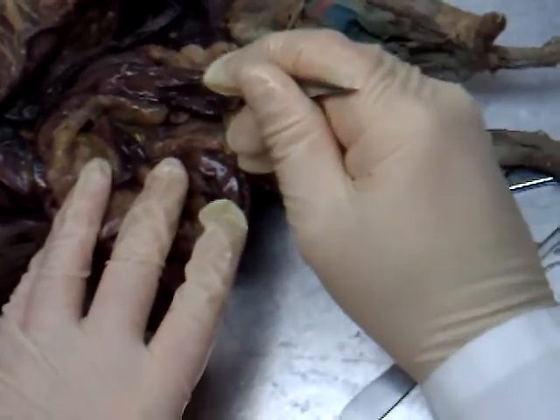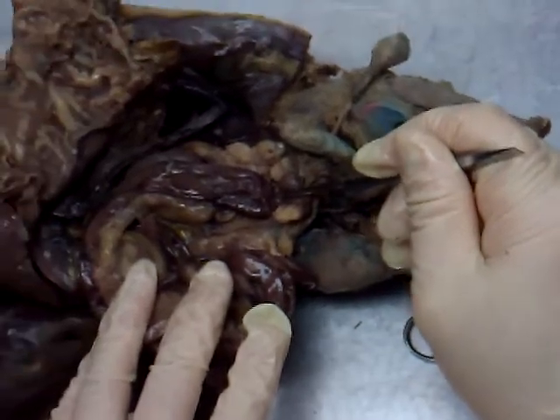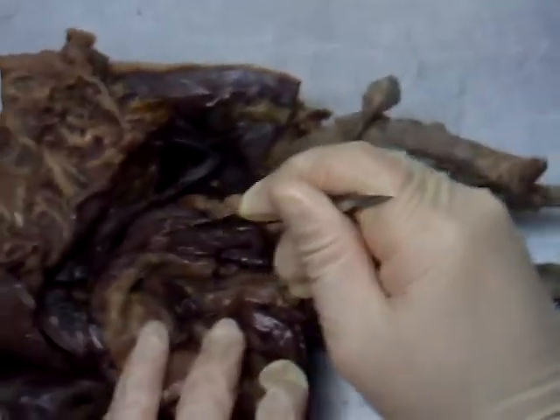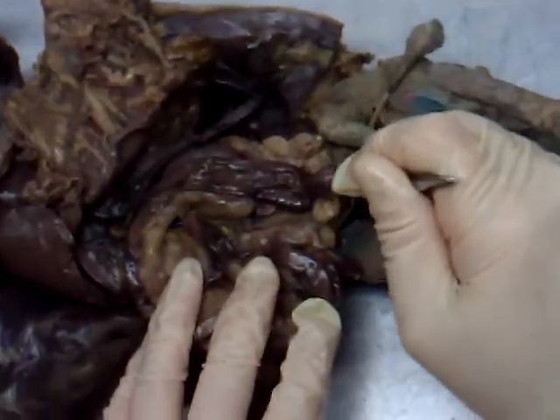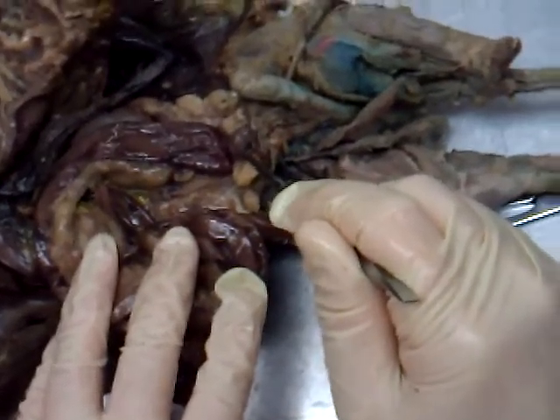Right here, where it starts to get wide — from this point on downward is the large intestine, or the colon. Way out here at the very bottom, the very base, that's the rectum. So we have ileum, large intestine or colon, and rectum most inferior. Right in front of the rectum is the urinary bladder.